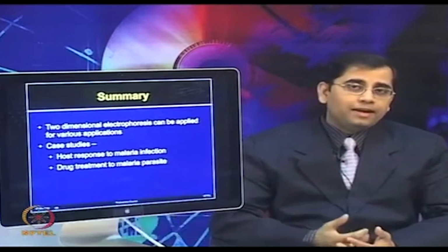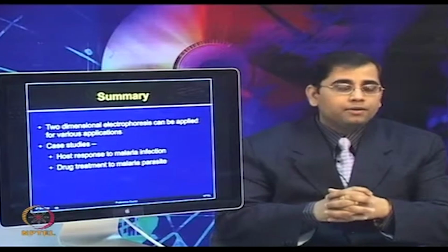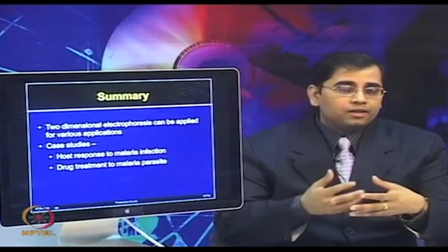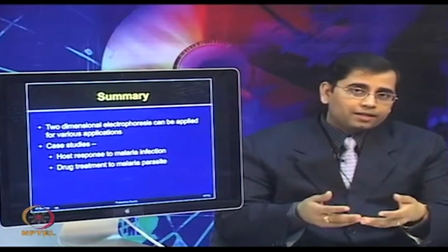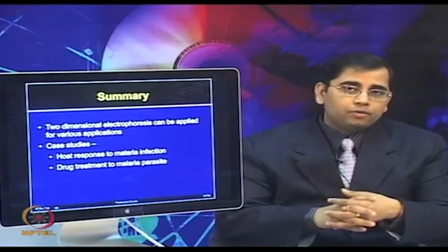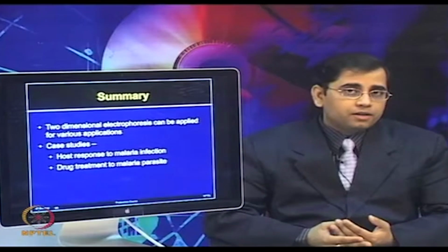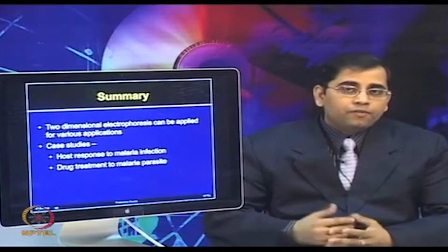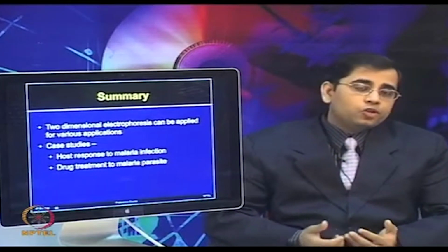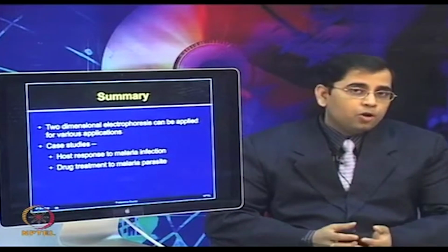But by giving you a case study and details of various type of experiments one need to perform, probably you got an idea that before performing that final experiment on your case and the controls, a lot of optimization has to be performed, and starting from your sample processing and how you can expand the coverage of the proteome. These type of quality control checks are very essential. If you can increase the overall proteome coverage, you can separate over 1500 to 2000 proteins on the gel reproducibly, then you have a good chance of identifying various potential targets, which could be novel drug target or potential biomarkers.